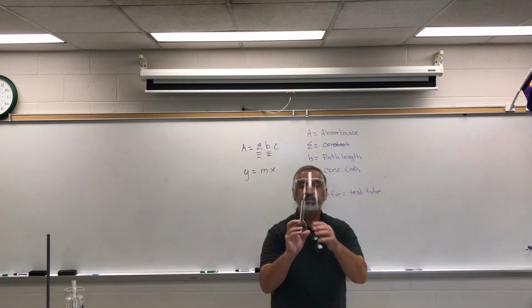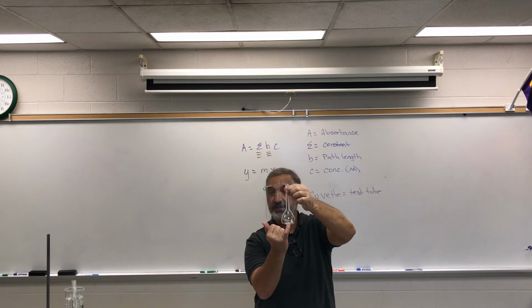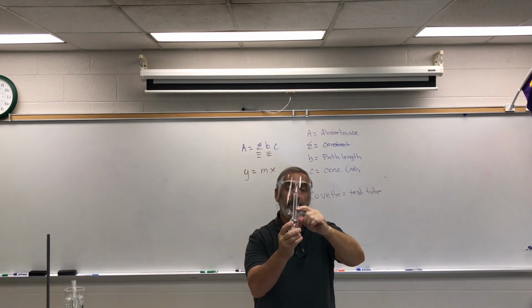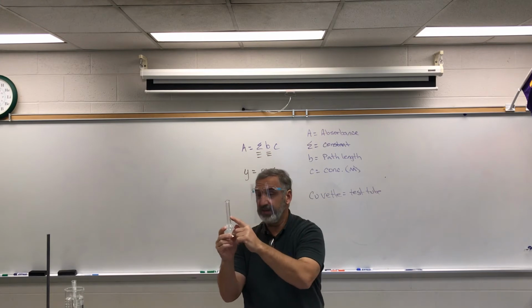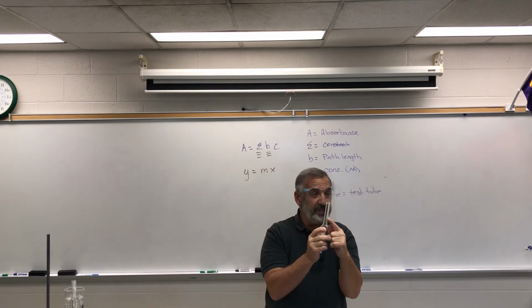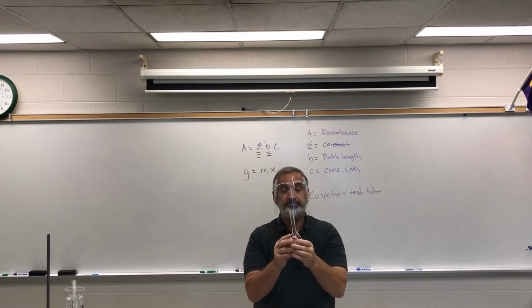So here is your 100 milliliter volumetric flask. First off, it says 100 milliliters right there. But there's no other markings on here except one line right here. Okay? That's the 100 milliliter mark. This is designed very, very accurately. If you're making a solution, the AP has to make a solution, you want to use the volumetric flask. Okay?